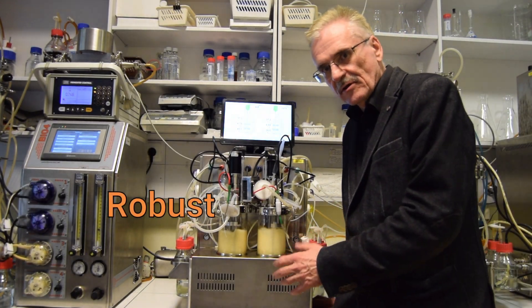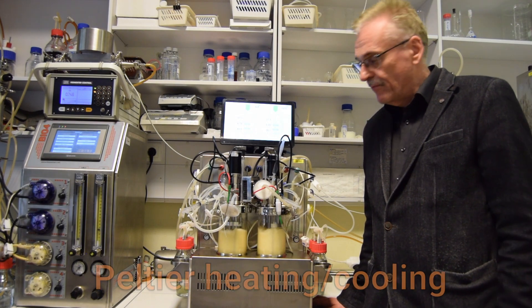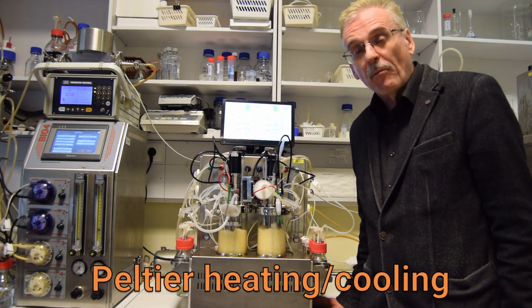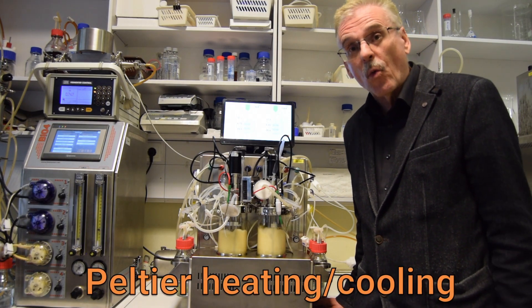This is a robust and easy-to-operate laboratory bioreactor. The heating and cooling is based on Peltier elements. This means that connection to a water line is not necessary.